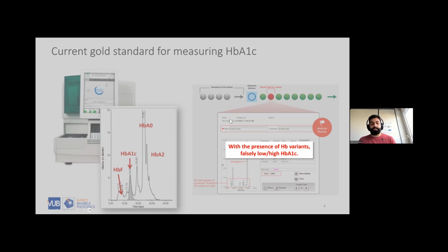But at the same time, we could do a sort of chemical fingerprinting of what is coming out of this chromatography device. Then we could say for sure what is coming out, for example whether what we see in the left-hand blood is actually HbF or not. Is it HbF combined with something else?